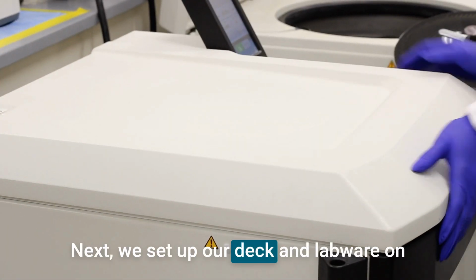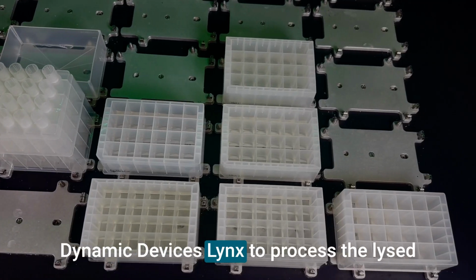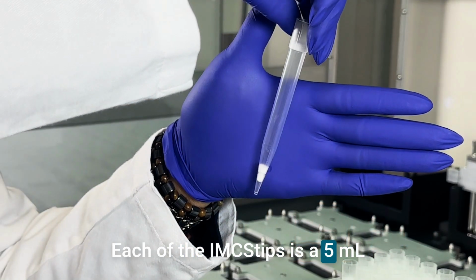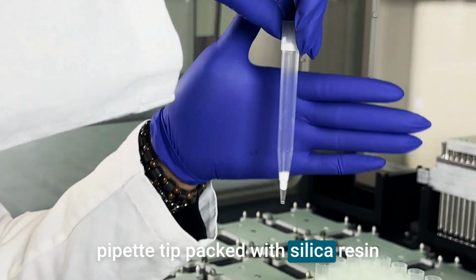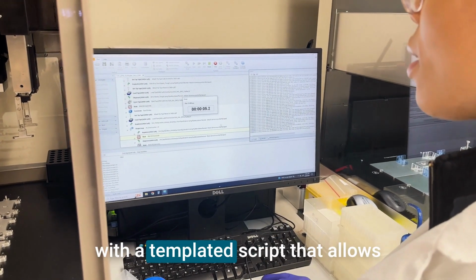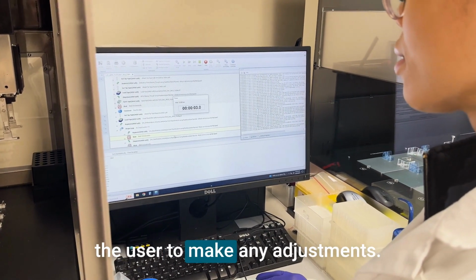Next, we set up our decks and labware on the Dynamic Device Lynx to process the lysed samples using the MidiPure IMCStip. Each of the IMCStips is a 5 ml pipette tip packed with silica resin that binds to the plasmid DNA. The automated workflow comes with a templated script that allows the user to make any adjustments.